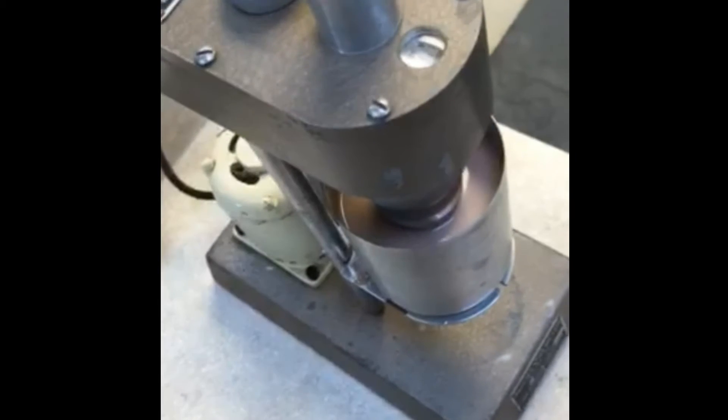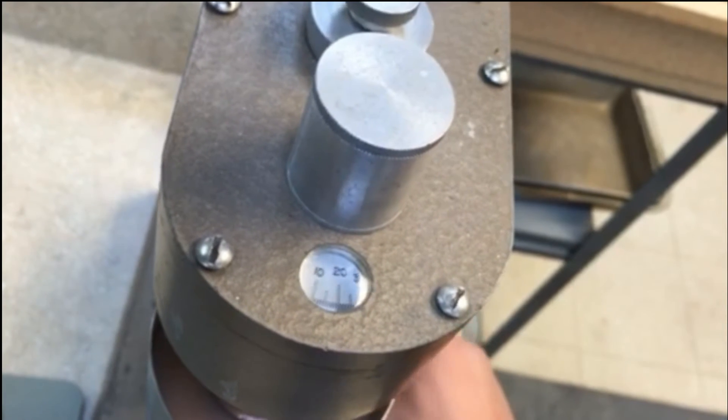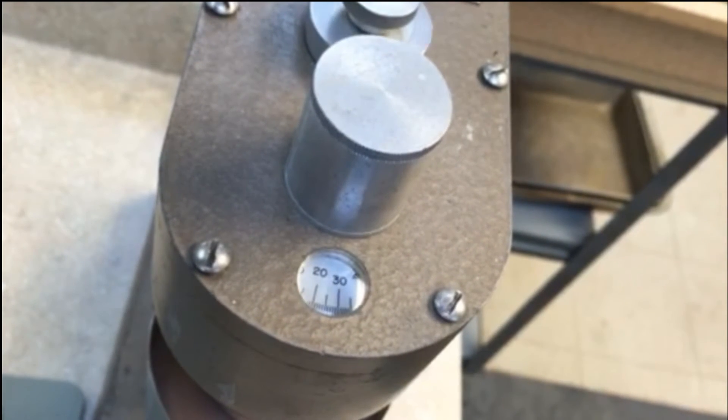What we do is use a machine called a viscometer. This is a classic viscometer produced by the Fann Corporation. It spins a bob inside the fluid and measures viscosity.